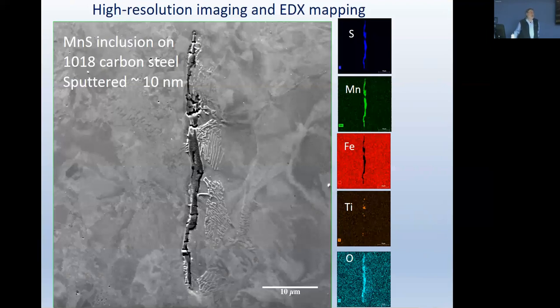So, any other questions from internet? Yes, actually, Recep, this is Robert Silagi from the chemistry department. Yes, sir. I have a question about the resolution related to the chemical analysis. So I assume that you can see differences, let's say, with an iron 3 and iron 2 oxidation state, but can you go even higher resolution, seeing differences like high spin, low spin, different crystal field splitting?